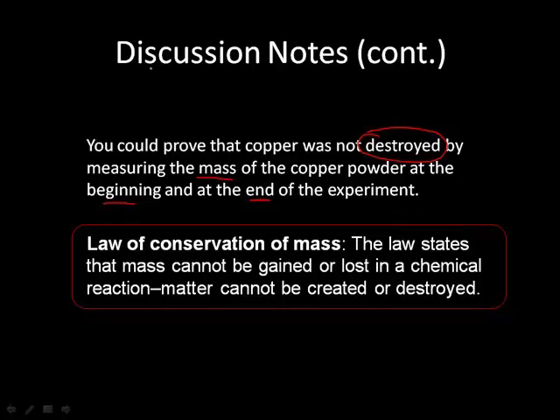In this lab, we can look at the fact that copper is known as an element. Evidence that it's an element is, one, the symbol. Second of all, because it is pure, just one substance, it's an element. It was not destroyed, even though it was mixed with many different things. In the first step we had the copper, and in the last step we had the copper again. If we took that copper product we produced and added nitric acid to it, we could make our copper nitrate again and go through the whole process again.